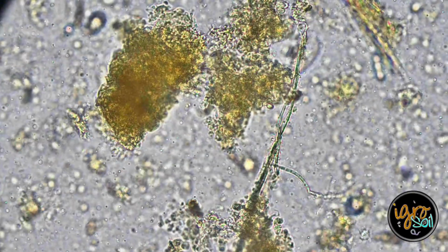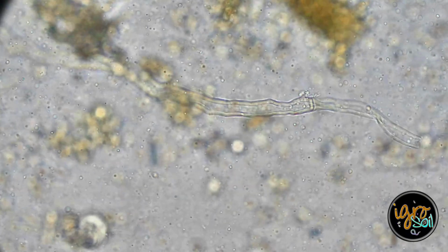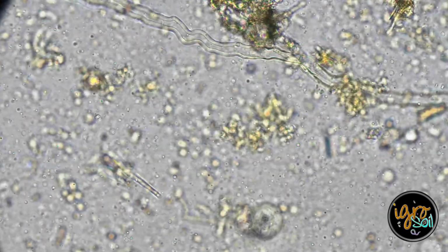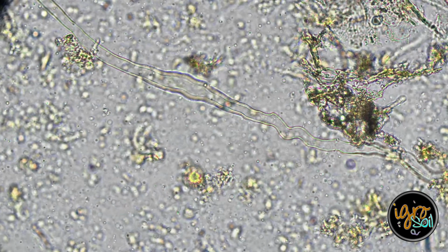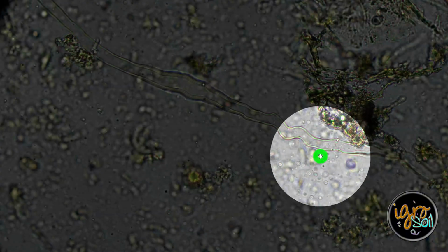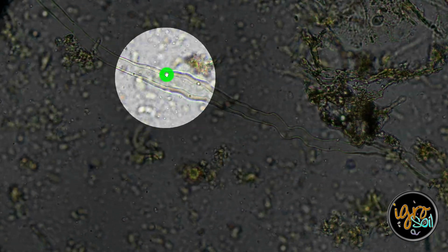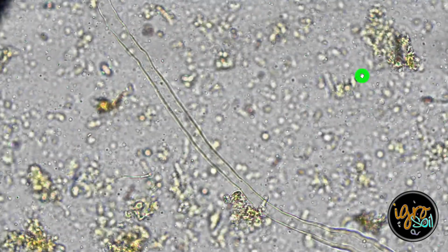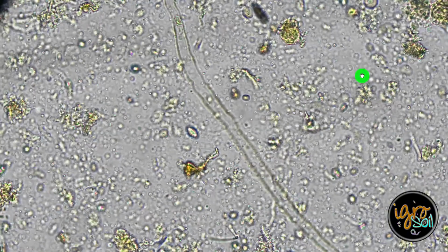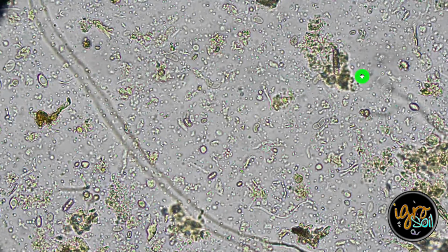Now, this here, I would comfortably classify as more of an actinomycete, saprophytic decomposing type of fungi if I had to classify it. This here, no idea what that is. I have no clue. That is thick. It's wide. For the most part it's very consistent, right? Let's look at it for a minute here. If you look at the way it bows, the width stays consistent. Here it flares out, but ultimately it's remaining pretty consistent as far as width. I don't see the septa. And then I guess my next question is, there's bacteria in it, so I'm happy to see that. Look at all the bacteria in this system.